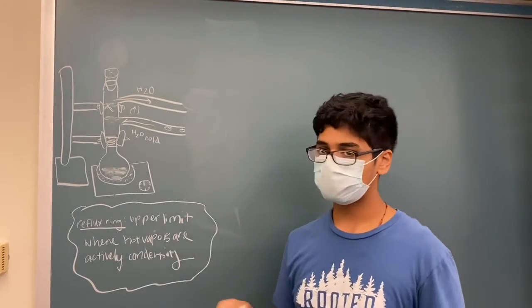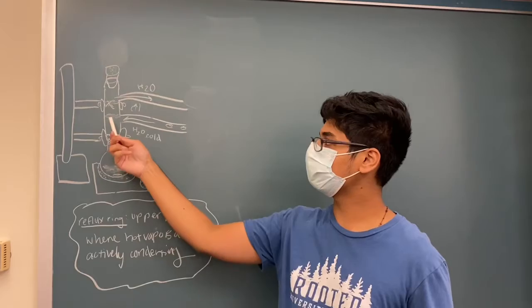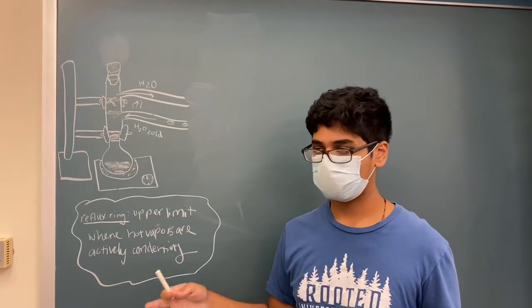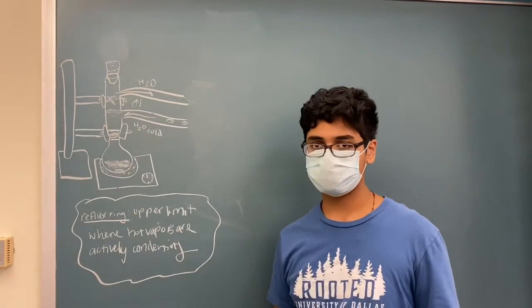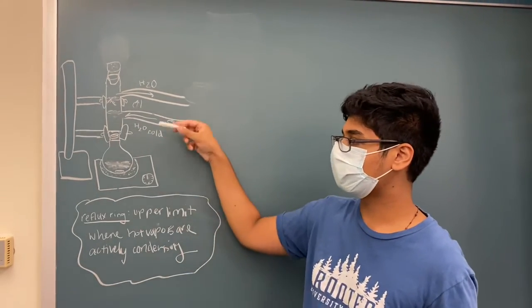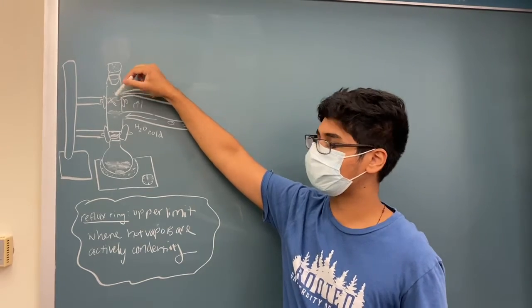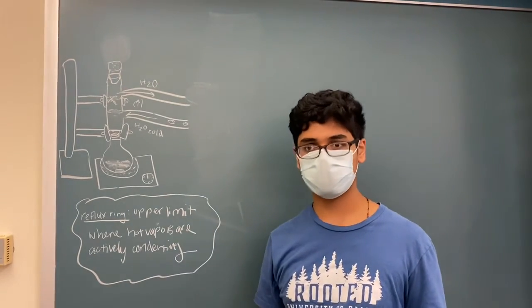So the reflux time period is when you see this lower one-third region of the vertical column where the reflux ring is observed, and you continue observing it until you see the reflux ring occur at around one half of the vertical condenser column.